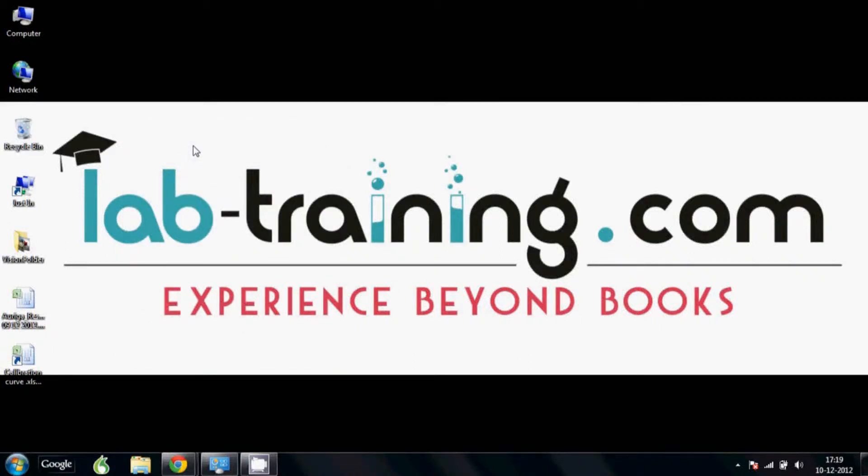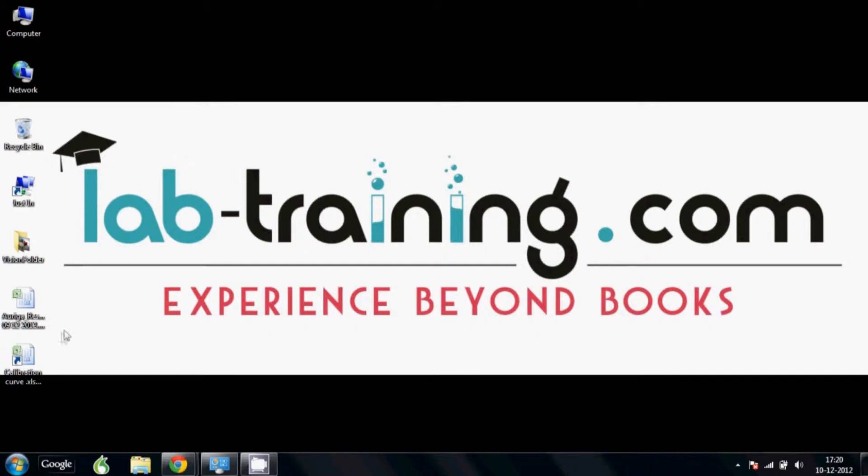Hello and welcome from labtraining.com. I'm Saurabh Arora here and in this video we are going to be seeing how we can make an Excel sheet to calculate the concentration of samples from a calibration data set.